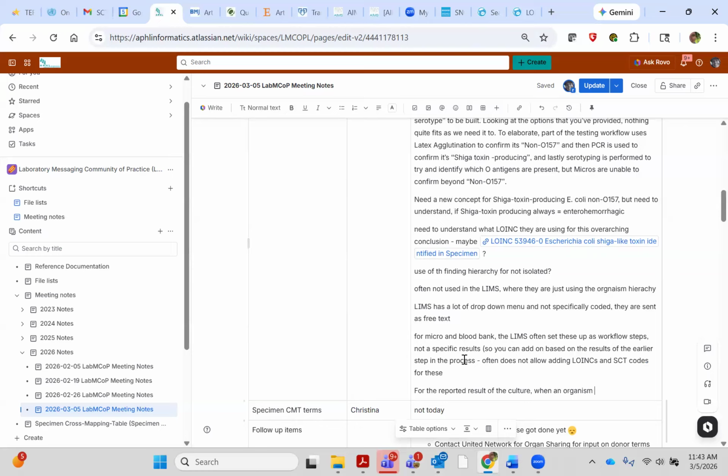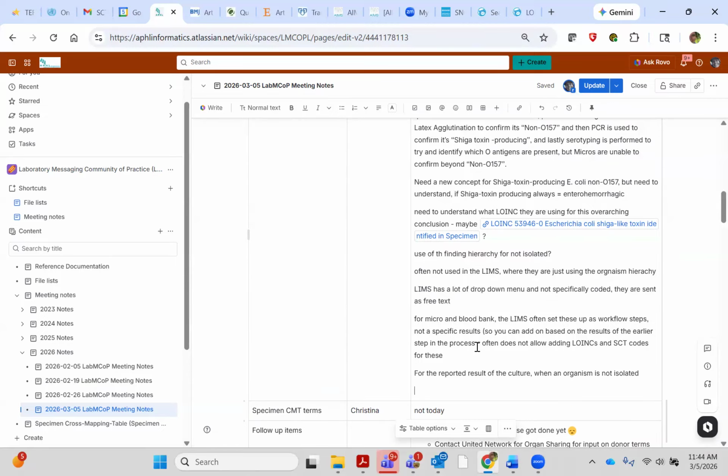Well, I disagree, because it's a free text string, and there are a lot of free text strings that are not mappable in LISs, because it assumes that field can be mapped to SNOMED, and that field is typically not set up. And I think Epic has it set up that way too, because that's why I wanted to start to look at that. Can we start to get it so it's mappable?